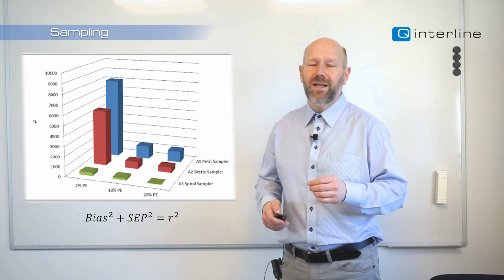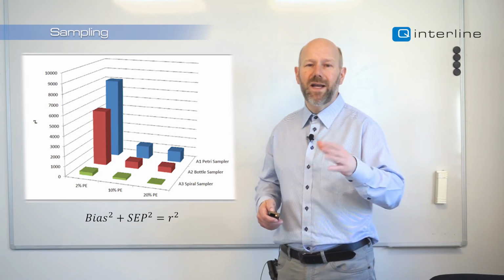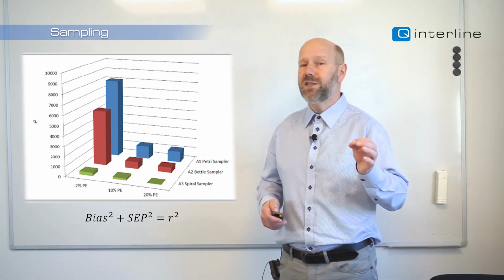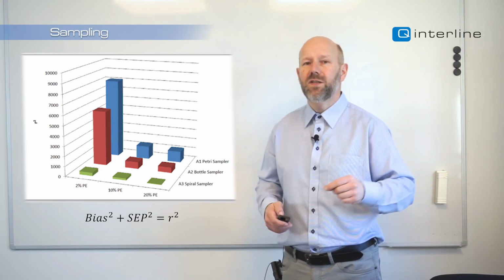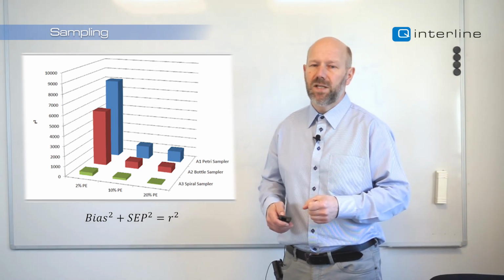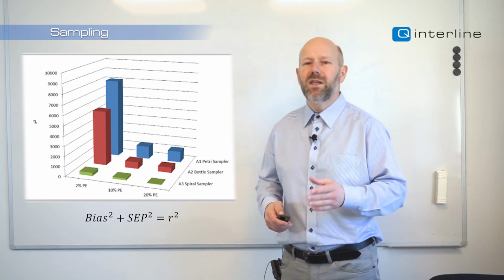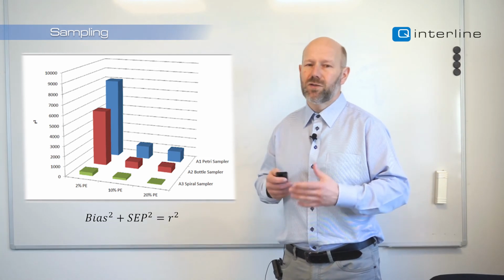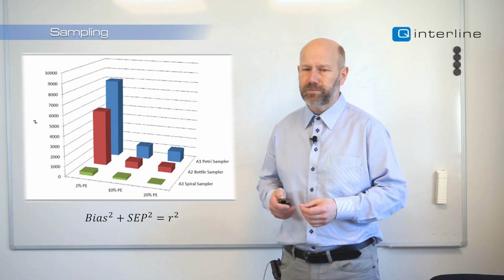When we look at that, it's obvious that for low concentrations of a binary sample, at 2% mixture, the odds that the petri sampler will actually see 2% of these pearls at the rim is very low, and the representativity is very, very bad. Huge biases are seen. The higher the concentration, the more the error drops off, because the chance that there will be a certain amount of plastic pellets in that area is higher.